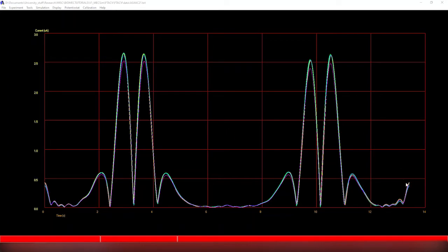That is a convolutional Gauss function published by another colleague of mine. Apply this. Generally, the window ranges are the same, except you'll have an STD function, or a standard deviation, of your Gaussian function convoluted with a windowed function. That can be explained there.